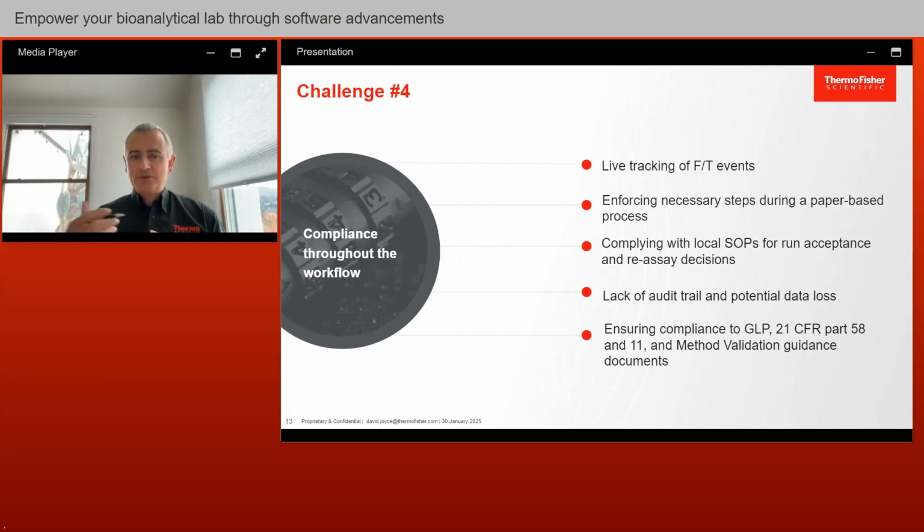Do you do that on a piece of paper? How do you then map that into your final reports, or is that done for you? Every time something comes out of a freezer, it's moved. Is that recorded? Can that be done in an automatic manner such that you don't misstep there?